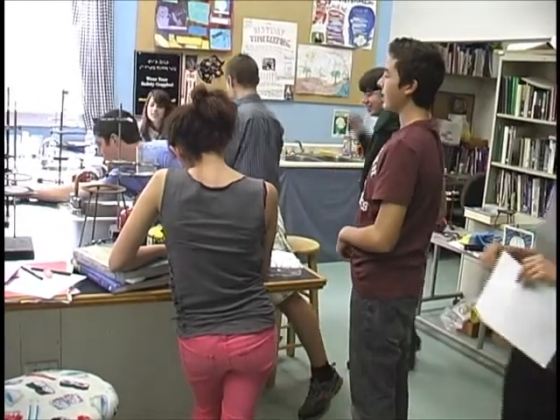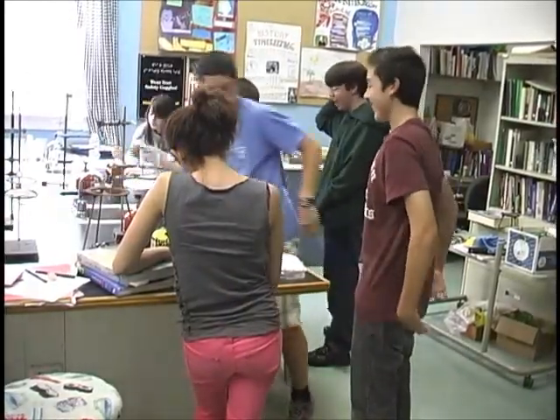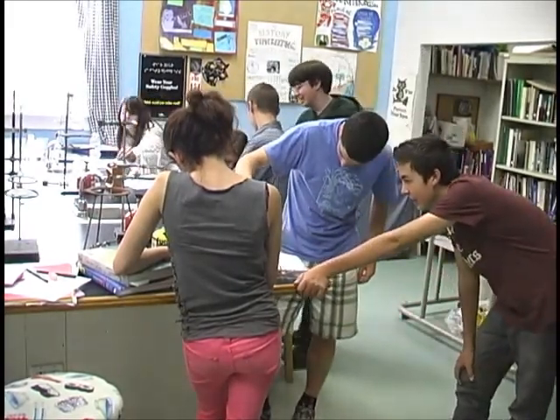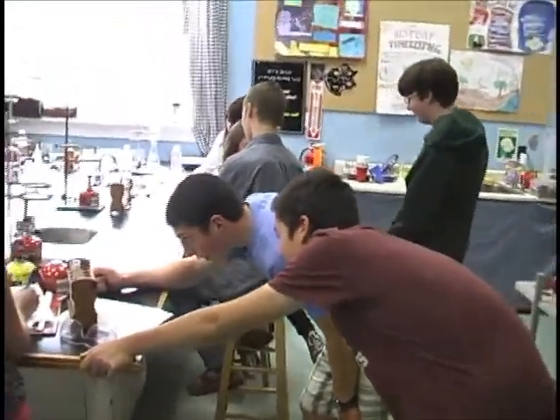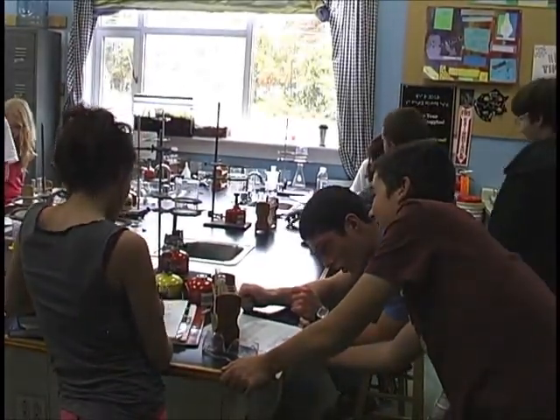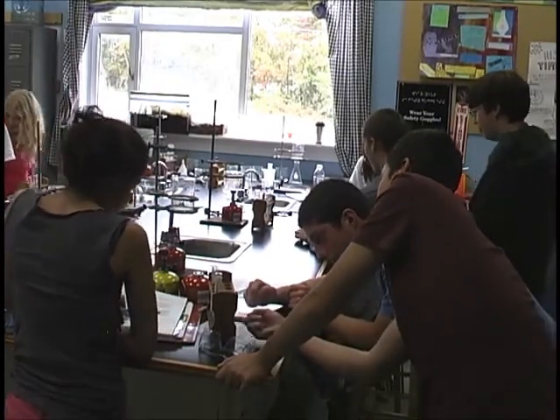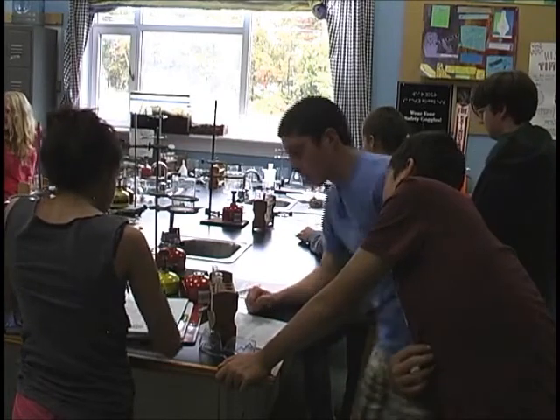I'm gonna try a little more. I'm gonna try some more. A is the most acidic from the way down. Whoa. Oh, A is very acidic. Yeah. I think it goes in order of acidity. Like it's just A, B, C, except for D. D is also acidic.